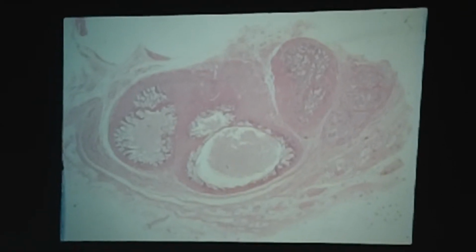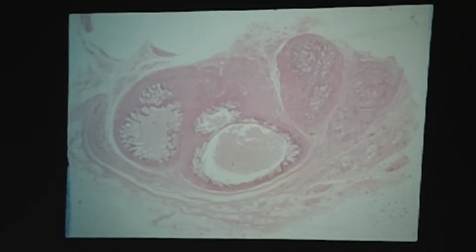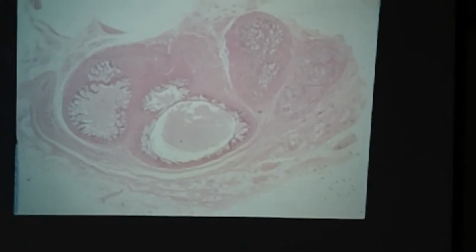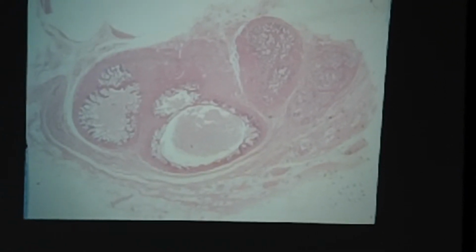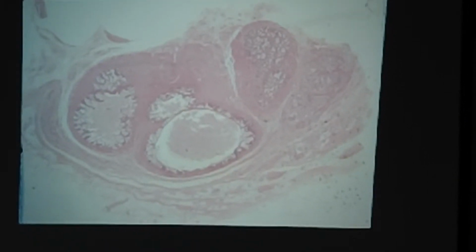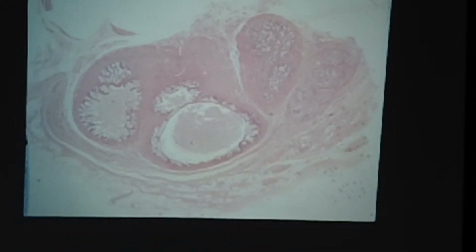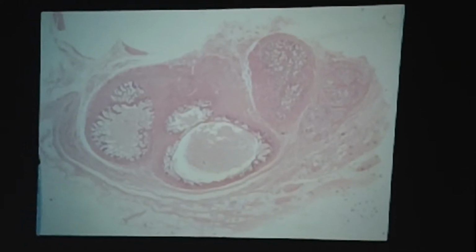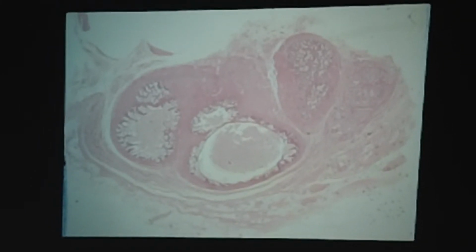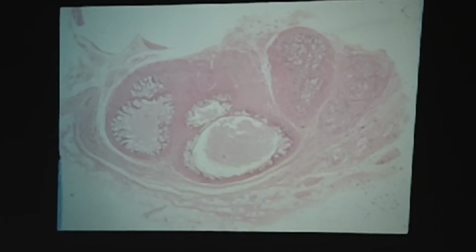Okay, when we're talking about seminal vesicle and prostate gland, you can read what we say in the lab manual and text about the epithelium lining the spaces. I'll just shine that on, okay? We're going to go for more of a low power gestalt here. If you look at this, your impression is a lumen that is plicated, or the mucosa is thrown into folds. As has been mentioned before, superficially similar to the ampulla of the oviduct, where you have that big folded mucosa.